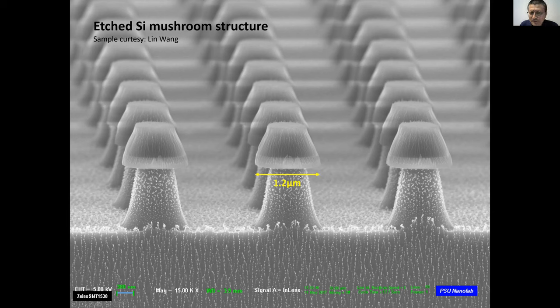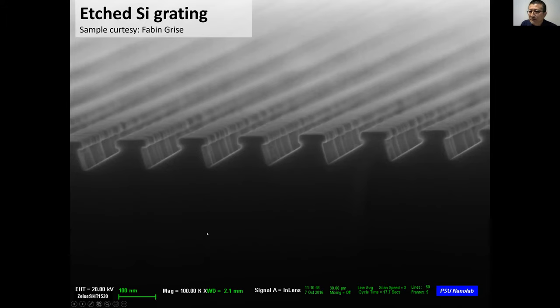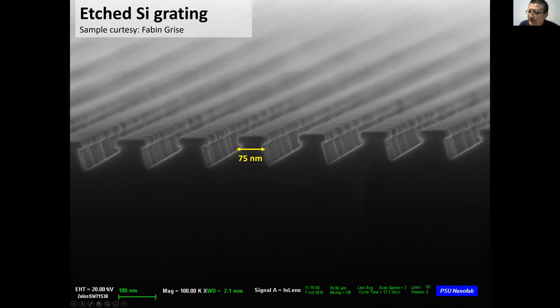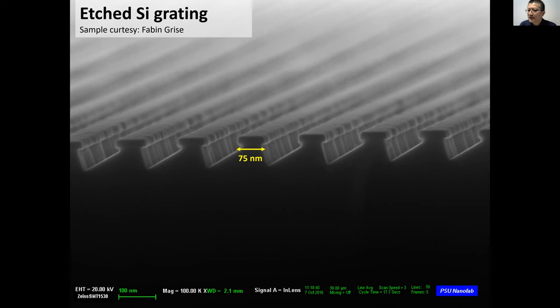Here's another example — a diffraction grating with features less than 100 nanometers, designed to reflect X-rays in space. We need very high magnification to image this. The voltage I use here is 20kV. Why? Because for the electron beam, a higher beam voltage gives a smaller beam size, so you get higher resolution. That's why I picked 20kV for this device.